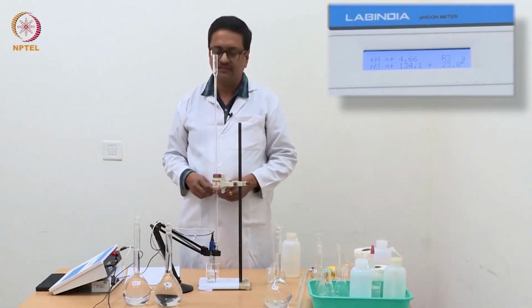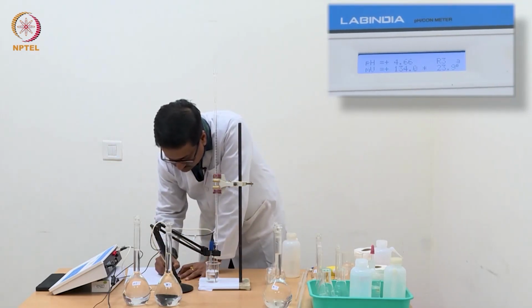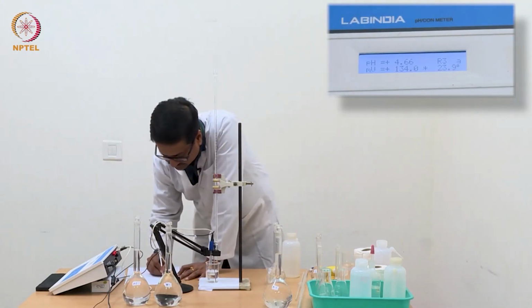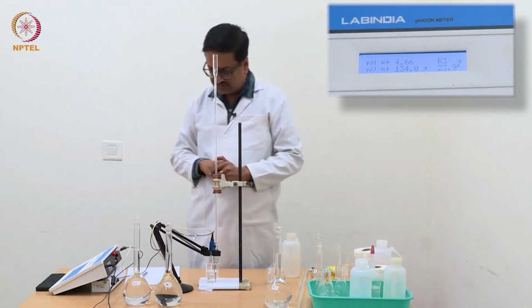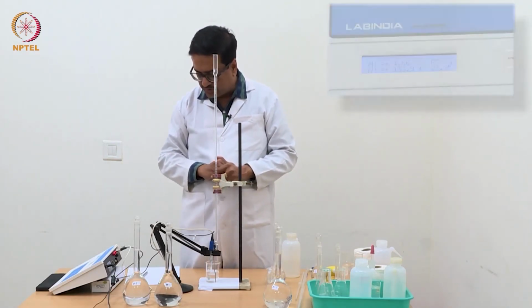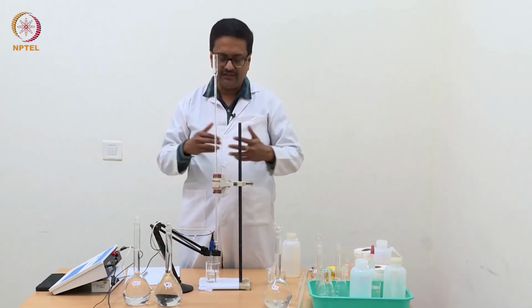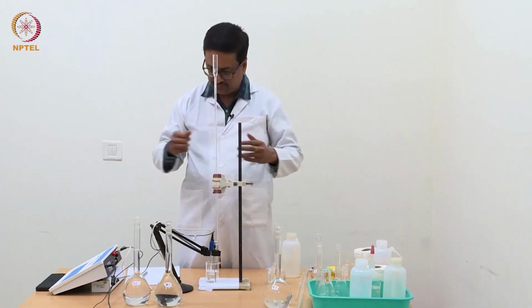Now I have reached 0.6 ml of NaOH and the corresponding reading is 4.66, that is, pH is increasing. So you can see that from 0 up to 0.6 ml there is an increase of about 0.9 in pH by addition of 0.6 ml of NaOH.